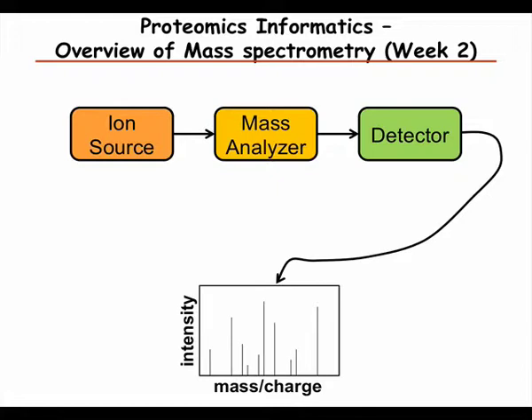Yes. That problem comes in several different ways. One is when you try to do quantitation, and you get peptides at the same time that have different sequences but overlap in the chromatography and have very similar or, in a lot of cases, identical mass.